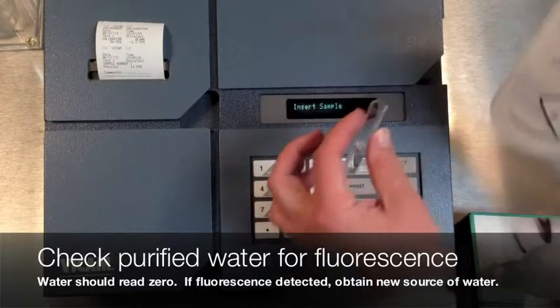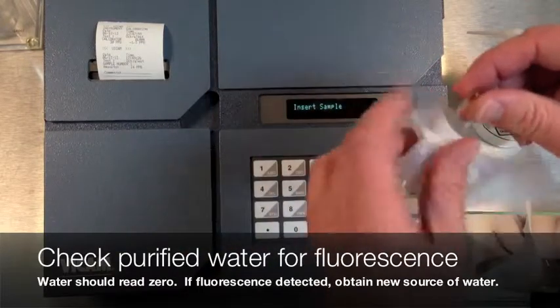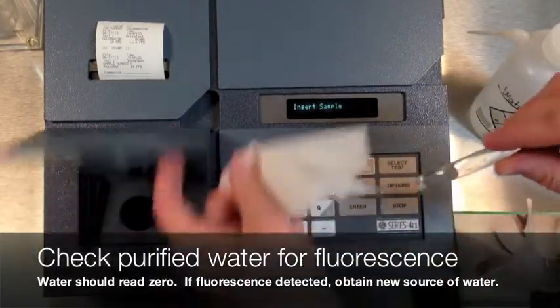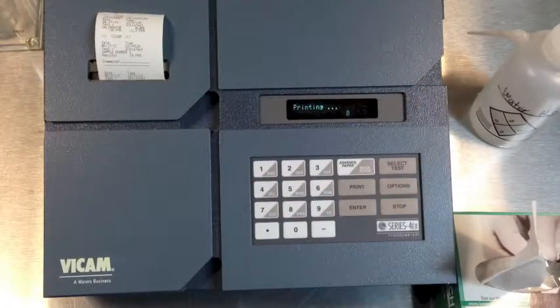Next, we will test our purified water. Put 2 milliliters of purified water in a clean cuvette. Clean with a Kimwipe and insert into the machine. Confirm that the result is zero.